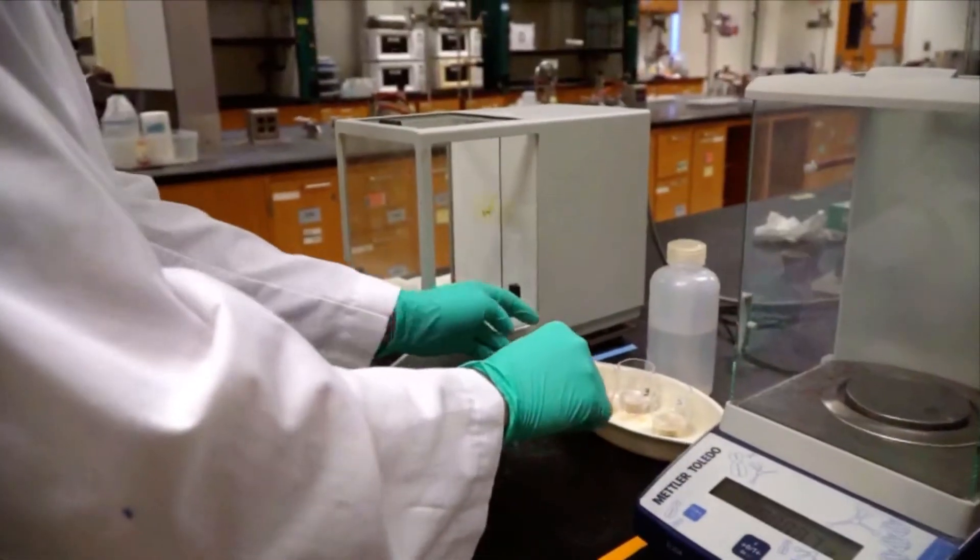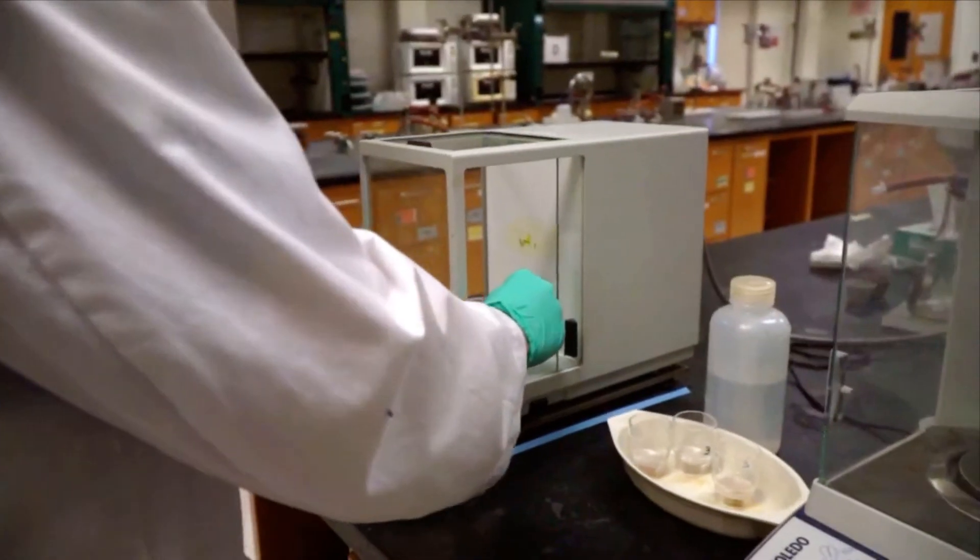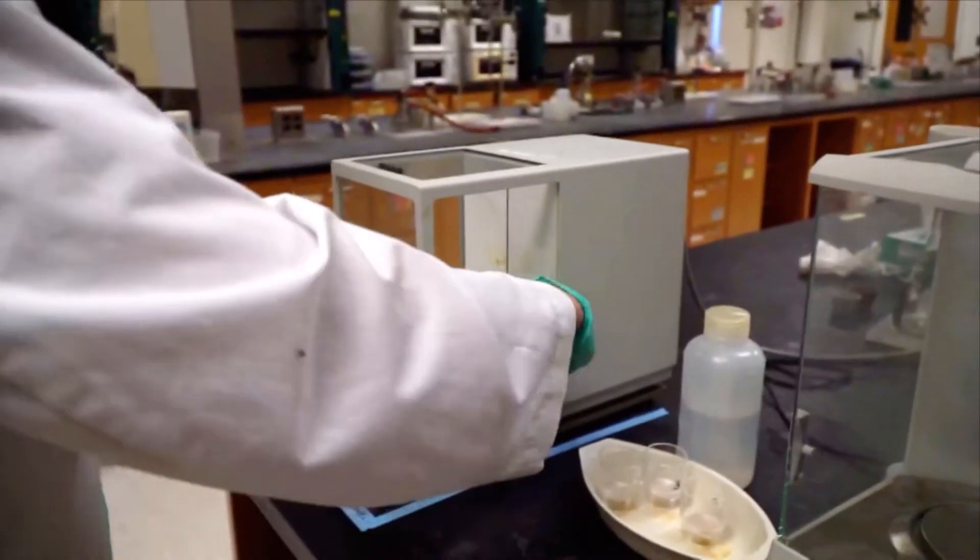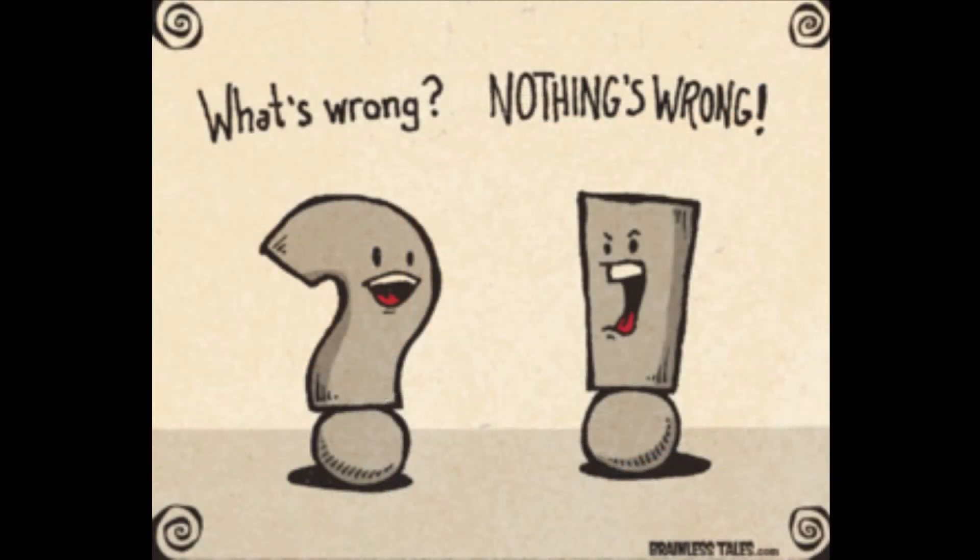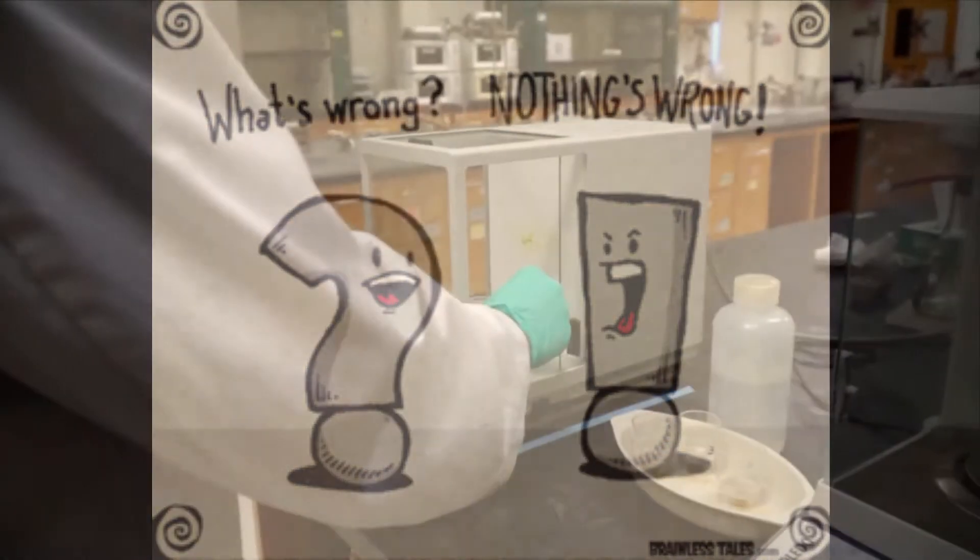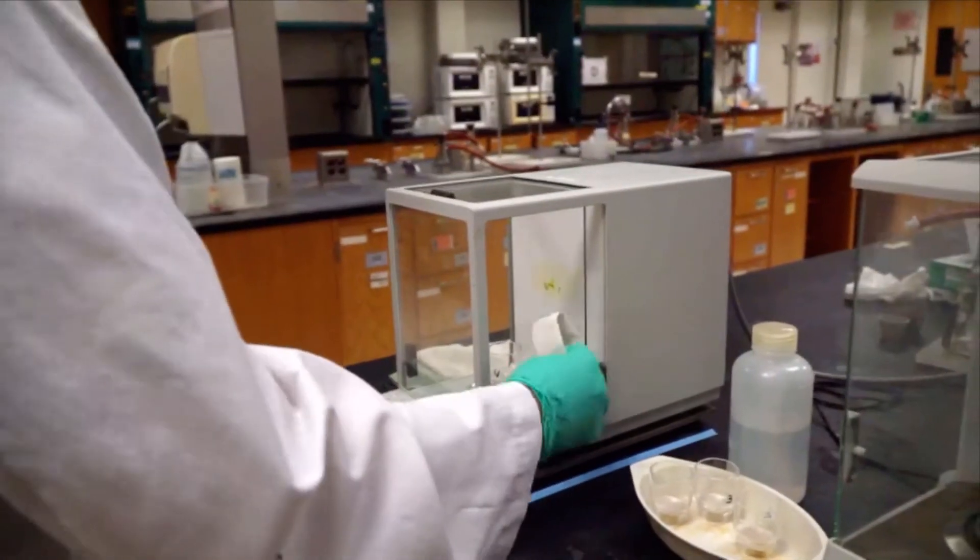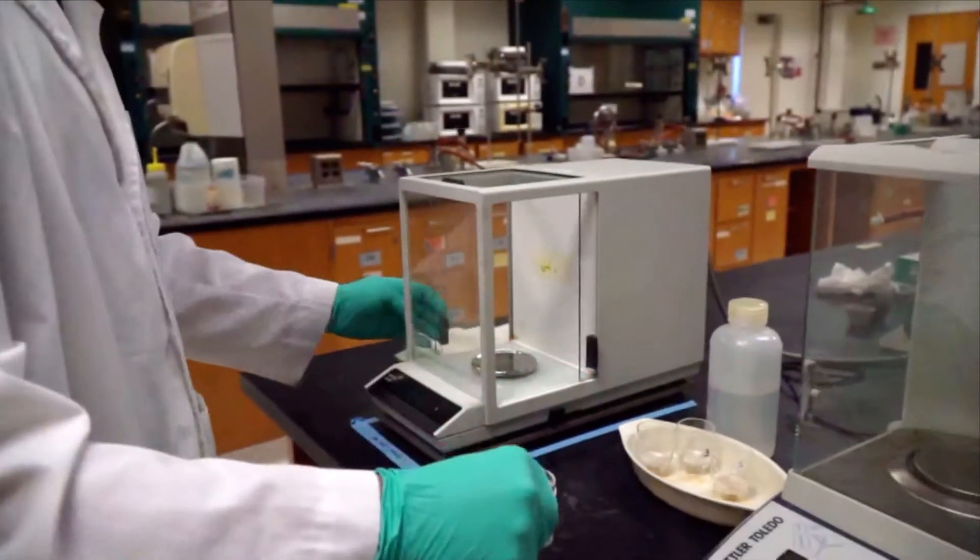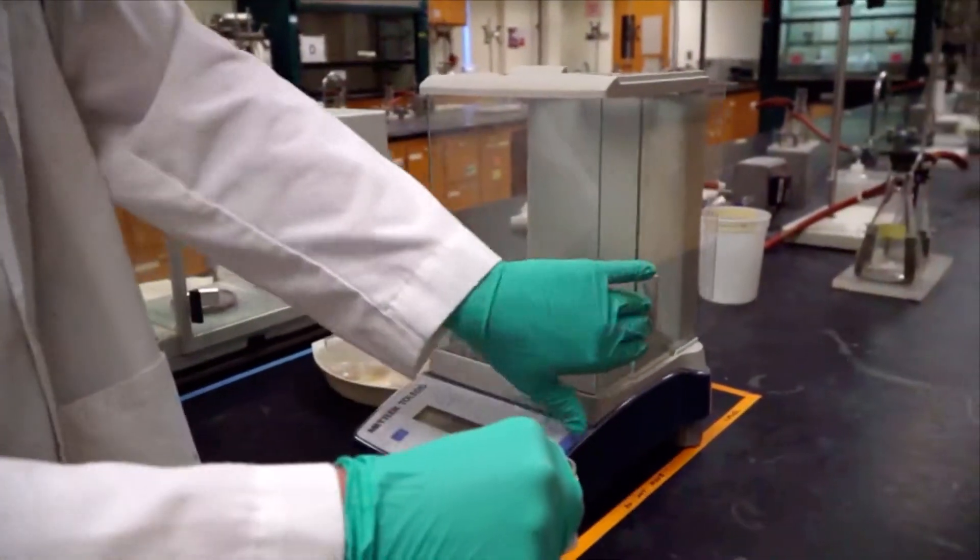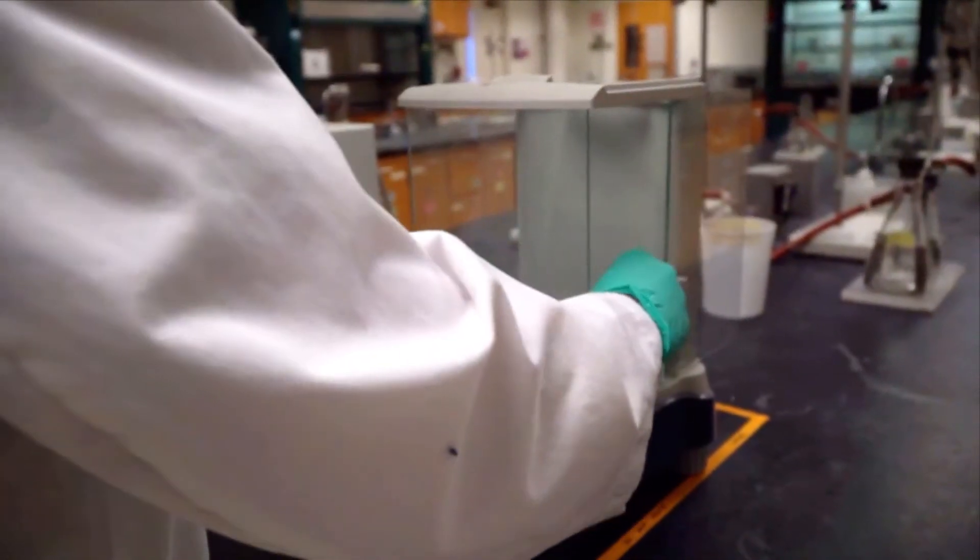I'll give you a moment to figure out what our chemist is doing wrong here. Have you figured it out yet? Of course, you must use the same balance for the same samples every time.